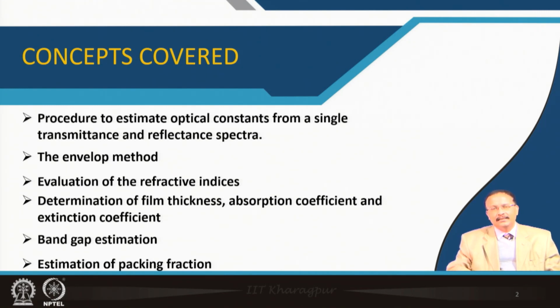Now, utilizing the data that you get out of this spectrometer, you can estimate a variety of optical constants from a single set of transmittance and reflectance spectra.